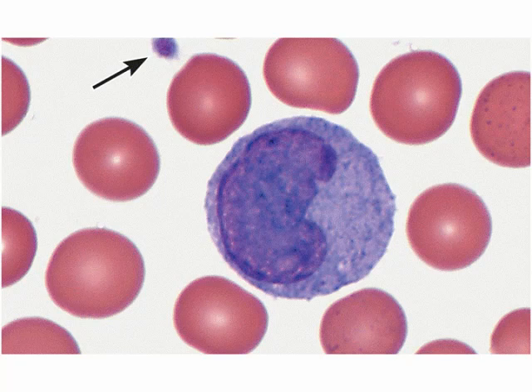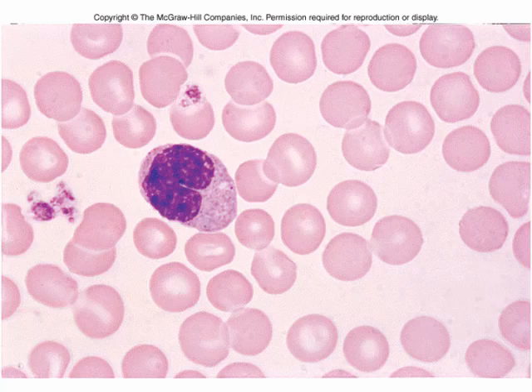This one is the monocyte. Almost always you'll see a bean-shaped nucleus, and then it has bluish stained cytoplasm. Not really distinct granules. I know it looks a little grainy, but nothing like that basophil or eosinophil. This is the largest of the white blood cells. Here's another monocyte. The blueness of the cytoplasm does not show up well, but the largeness of the cell does, and the bean-shaped nucleus does.